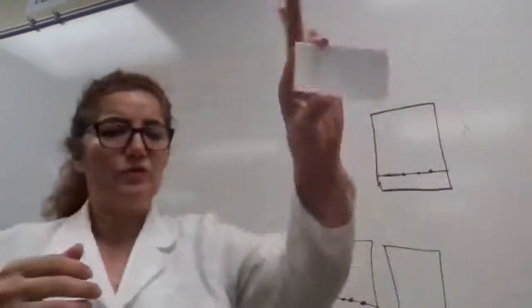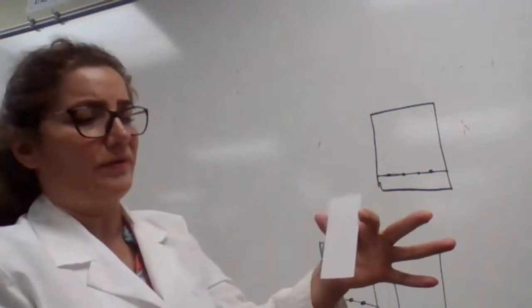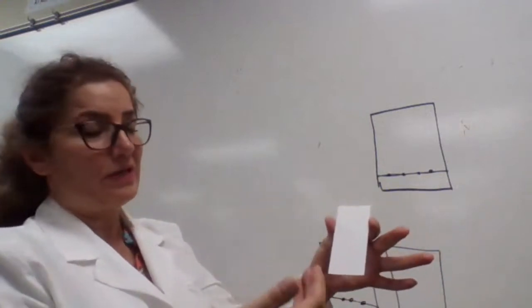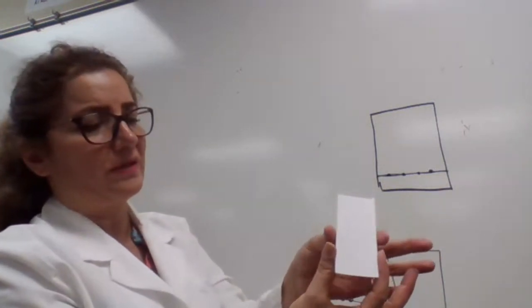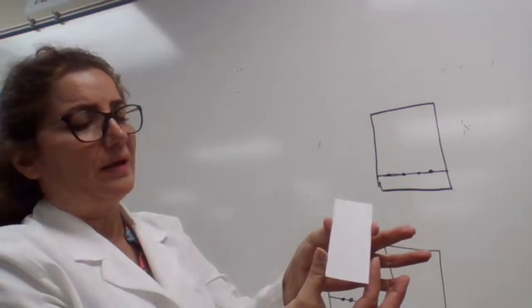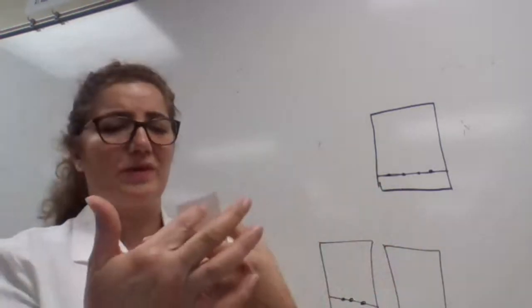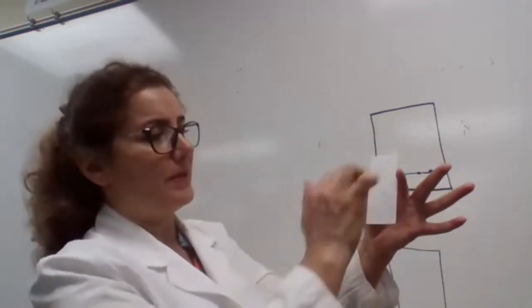When you use the TLC plate, you should never touch the dull side, because the oil from your hand can get on it and it will cause contamination to your chemical later. You should hold on the side only. The shiny side is okay. You can touch the shiny side because there's no action or separation taking place on that side.